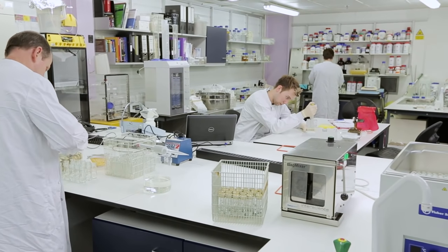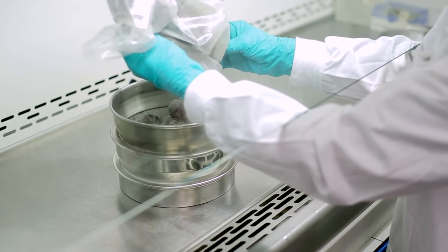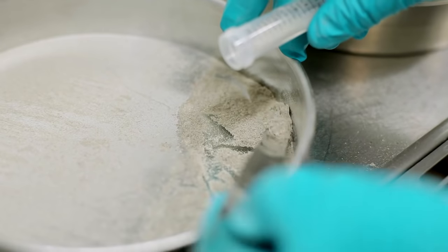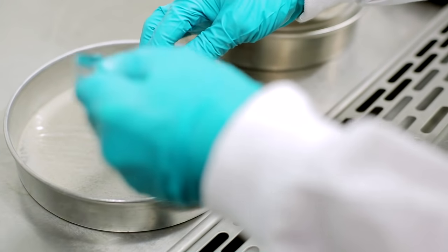We built the Microbiology Lab here at Dyson about 13 years ago and as far as we know it's the only in-house lab of any floor care manufacturer in the world. We wanted to really understand what was in house dust but we couldn't find that expertise anywhere so we decided to build our own lab.